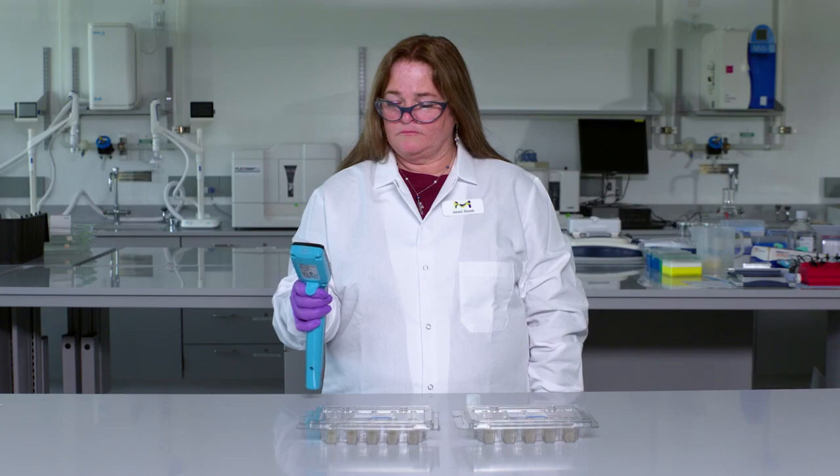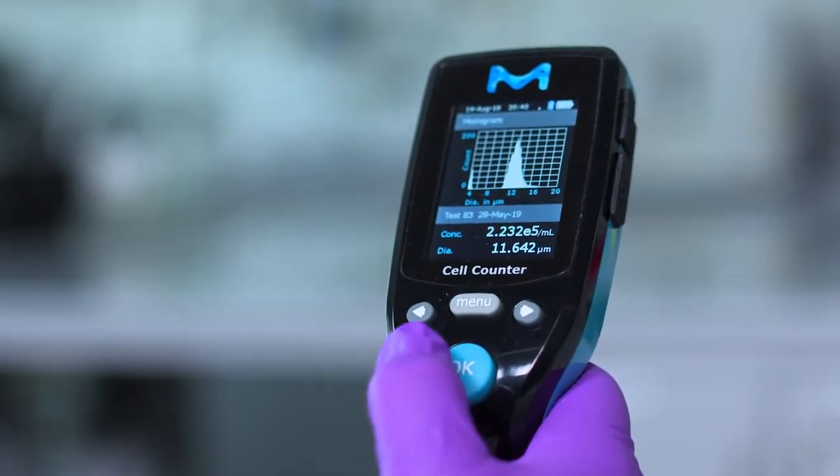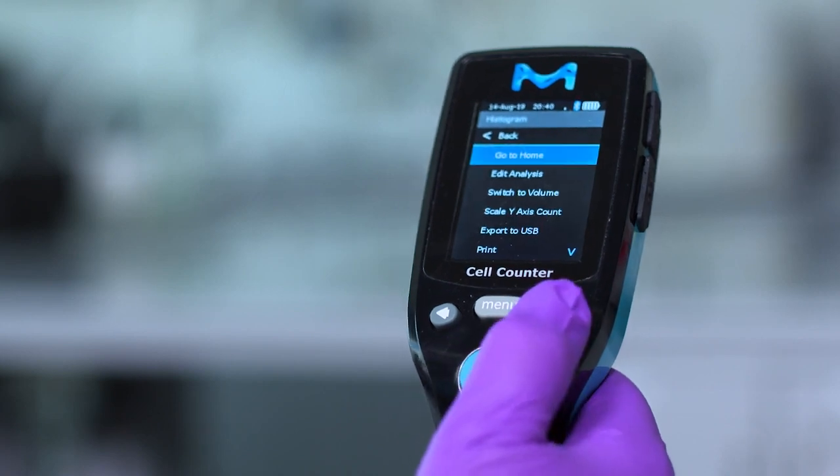There are two ways to gate. First, directly after histogram is generated, press the OK button and go to edit analysis.